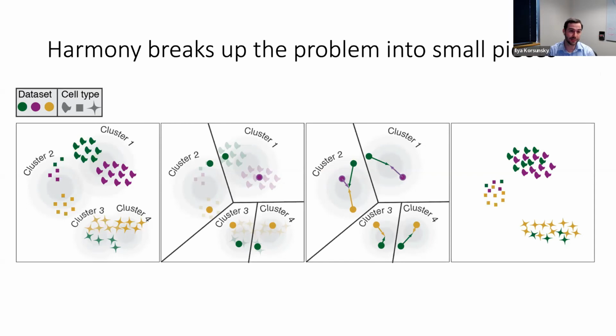Harmony does not use nearest neighbors at all, right? It uses Gaussian mixture models instead of nearest neighbors. And so I think that's what makes it super fast compared to KNN things. The second part to the question is orthogonality, right? So we don't assume that.